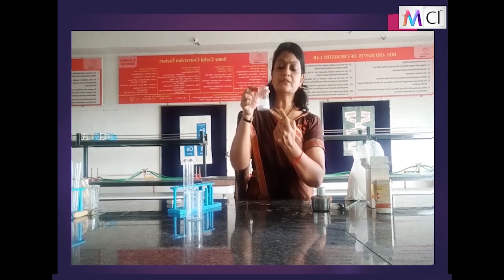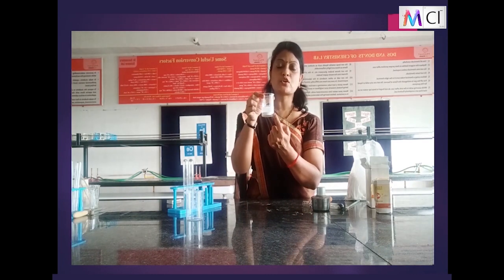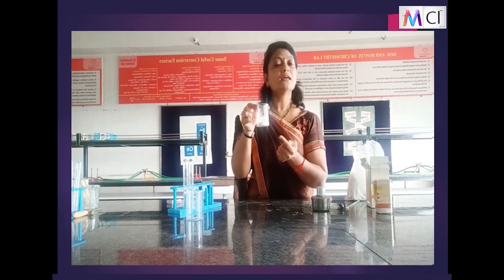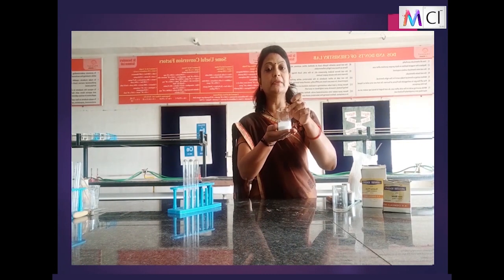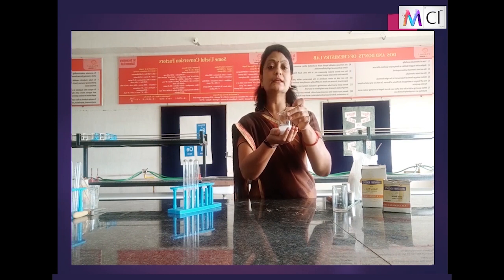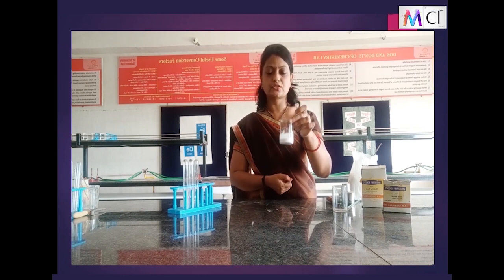Children, here you can observe that the slaked lime, that is calcium hydroxide, settles at the bottom and a clear solution of slaked lime is formed at the top, which you also call lime water. Now if I touch the beaker, it is slightly warm. That is, this reaction is exothermic in nature.